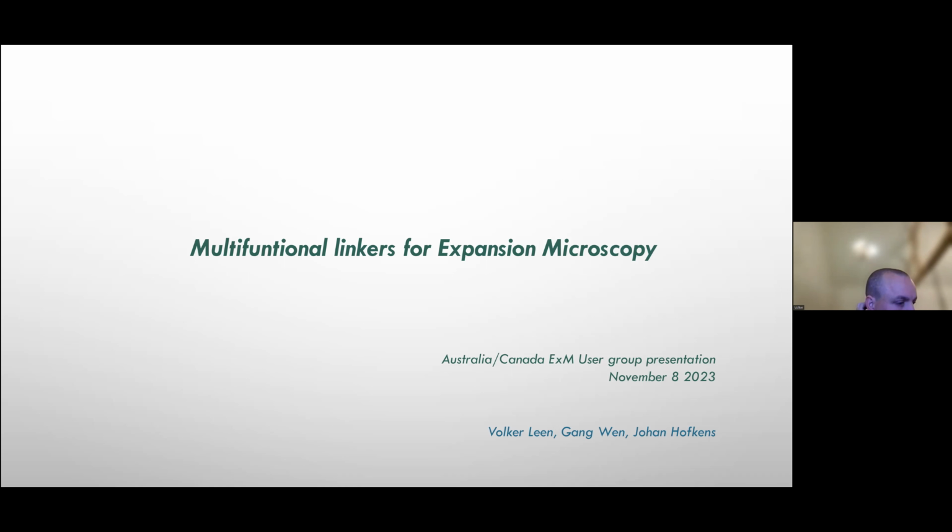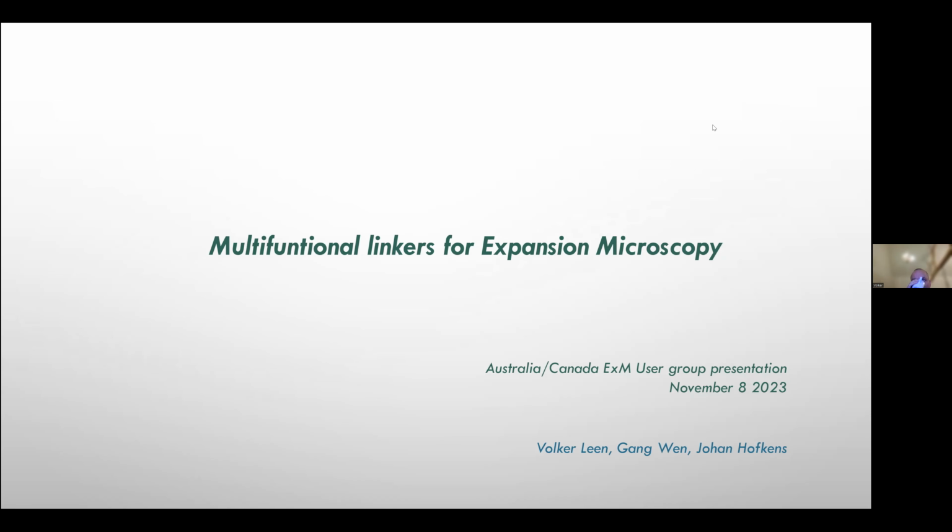I was at the International Conference of Photochemistry organized by Marcus Sauer in Würzburg, together with colleague Maarten Roefhuis. We were involved quite heavily in super resolution microscopy at that time. And that conference is the first time we have seen somebody talking about the expansion microscopy. And in all fairness, when I saw it the first time, I was very skeptical.